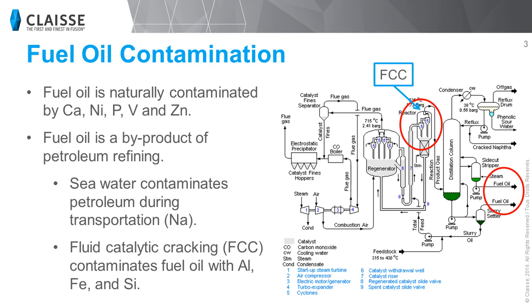During the refining process of petroleum to obtain fuel oil, fluid catalytic cracking catalyst is often used to maximize the distillation of hydrocarbons with a high octane rate. Some contaminants such as nickel, iron, vanadium, silica, alumina, sodium, and copper are found in FCC catalysts and are transferred into the fuel oil during the refining process.